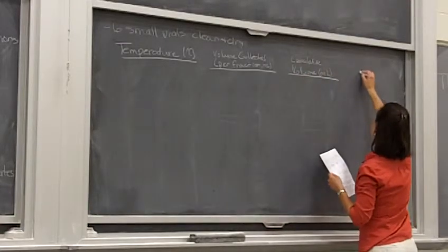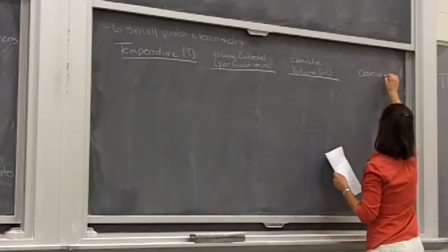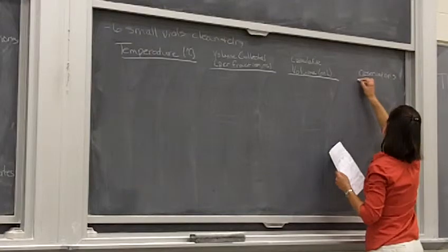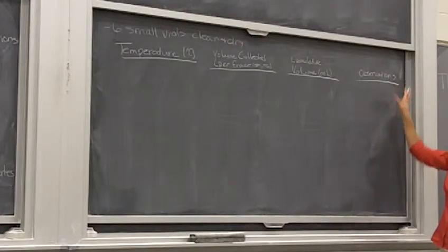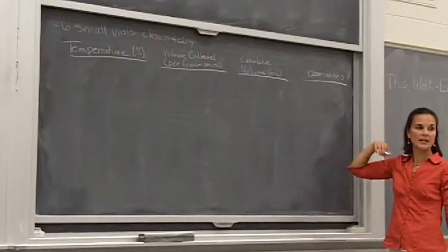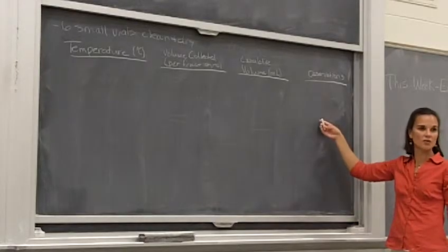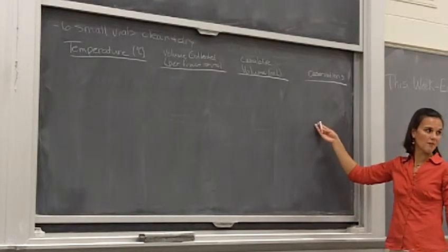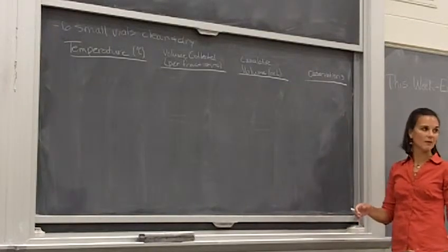And you're going to have your observations. Now, one thing that is really key to all this is observations, and a lot of times what people forget to do in all this, they're so worried about getting temperature and volume and getting their whole table collected, you don't get any observations. So make sure that you do include observations. Tell when you change the Ohmite setting. Tell when things started boiling. Tell when the temperature started dropping. Write down when the temperature starts increasing. Put all these observations in this table, okay?